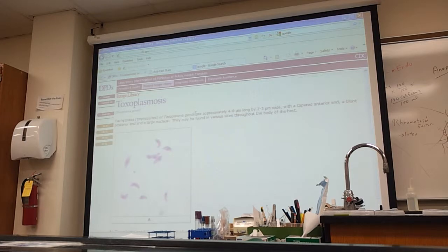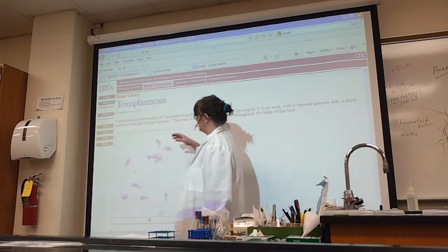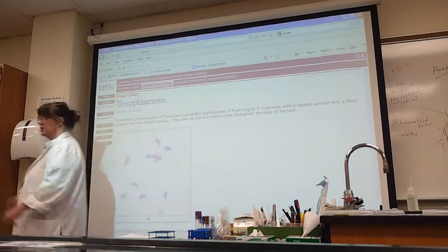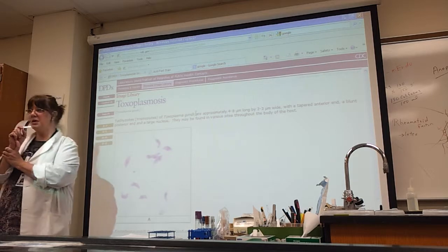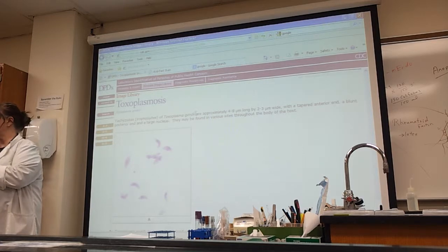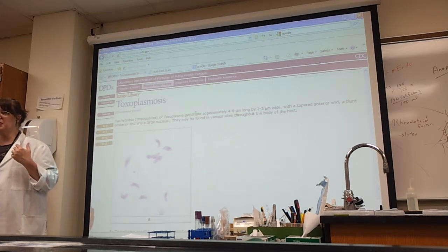These are your toxoplasmosis and disease. The Toxoplasma gondii is the scientific name. These are your trophozoites, that's your feeding form. As soon as you see little commas, or little boats, or little canoes, and something's down on that card maybe about cats, you know what to put down. Toxoplasma gondii for the organism. Disease would be toxoplasmosis. As long as you spell it close, you're okay.